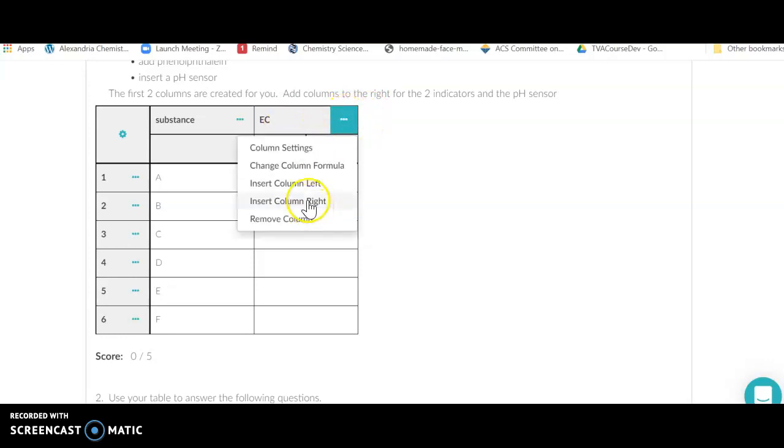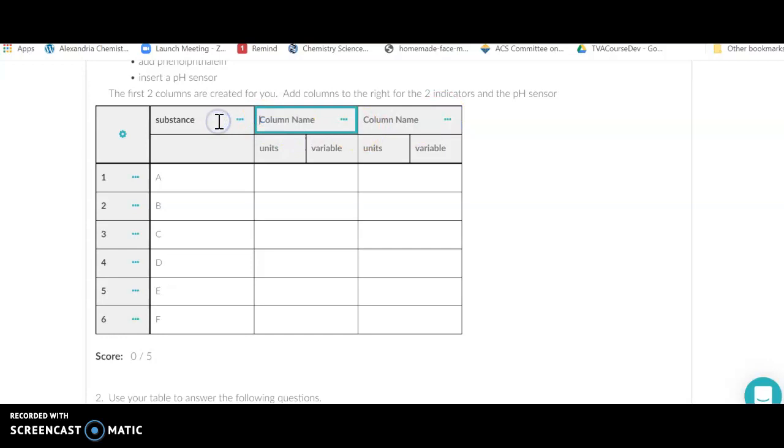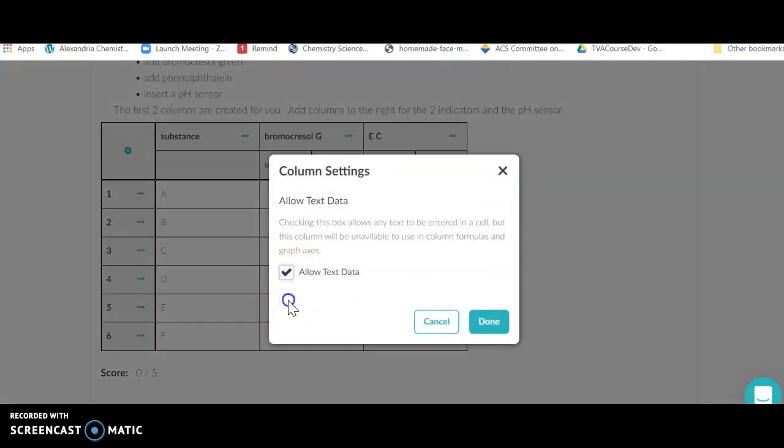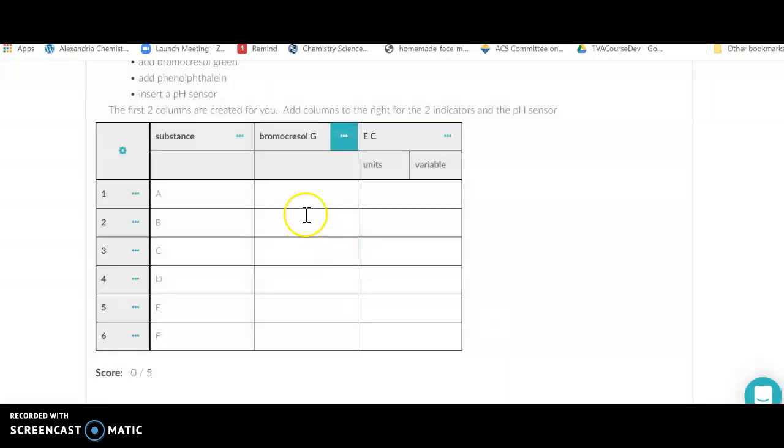For the first one here, I can add a column to the right and put what I need here. So if I put my bromocresol green here, on my next one I might put electrical conductivity, and I'm just going to put EC for that. We can put in the results as you see them. When you want to put a color, you can't type blue in, but you can if you go to these three dots, go to column settings, and go down to allow text data.